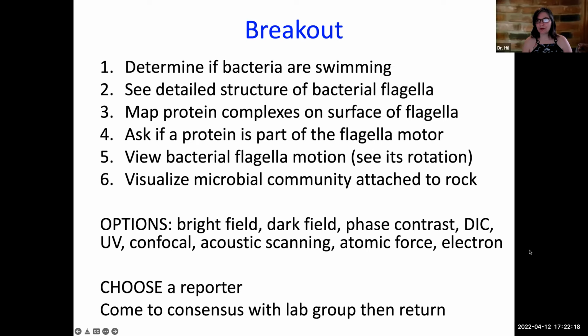No brave souls want to raise their hand. What about in the chat? Put your answer into the chat if you had any idea for that at all. Yeah, I agree with you, Sarah. I think a fluorescence microscope might do the trick. Okay.